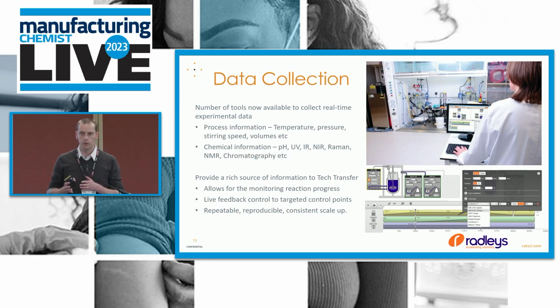Again, prediction is really important, but you need to augment that with collecting as much data as you possibly can. And in our labs, we're able to collect information such as temperature, stirring speed, volumes, etc., all of that kind of process information, and then combine that with chemical information from a number of different probes, some listed here. In fairness, NMR we don't have online, but these kind of tools are available to collect information from your processes. Then combining that with your models, your chemical engineering models, what's happening at different times along the reaction progress, you can really start to transfer information to a manufacturer where they'll be able to control that based on this level of information. It allows them to monitor reaction progress. If they've got the capability, they can use that information for feedback control, and it produces repeatable and reproducible, consistent scale-up.